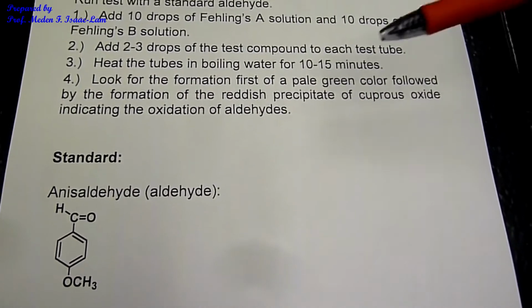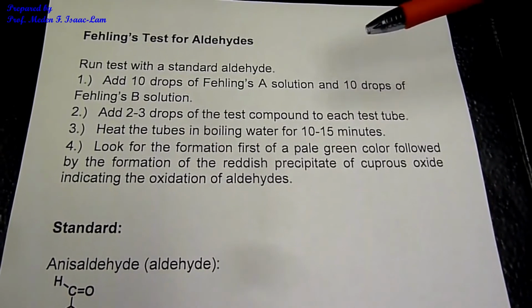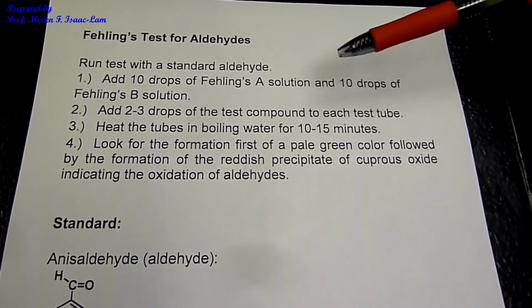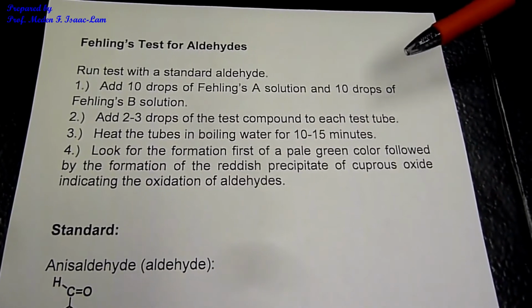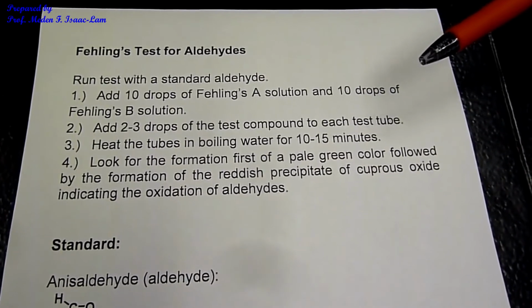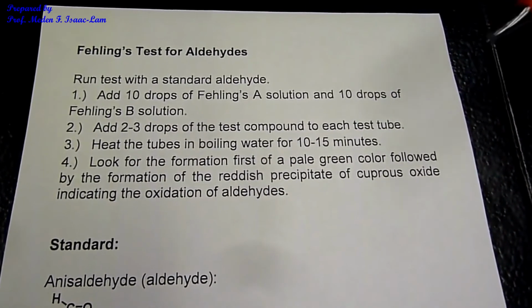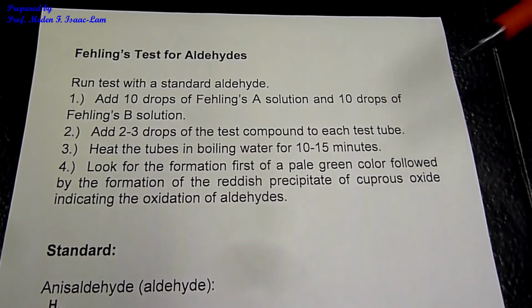We are now going to mix together the Fehling's solution A, which is copper(II) sulfate, with Fehling's solution B, which is potassium hydroxide, so it's basic. Then we add 2 to 3 drops of the test compound to each tube, the unknowns and also the standard.